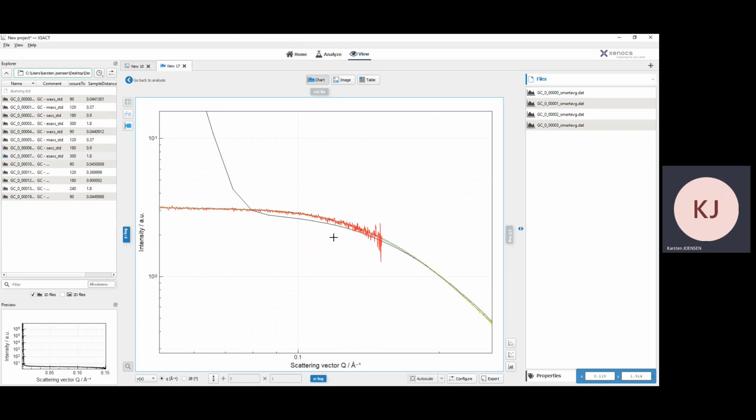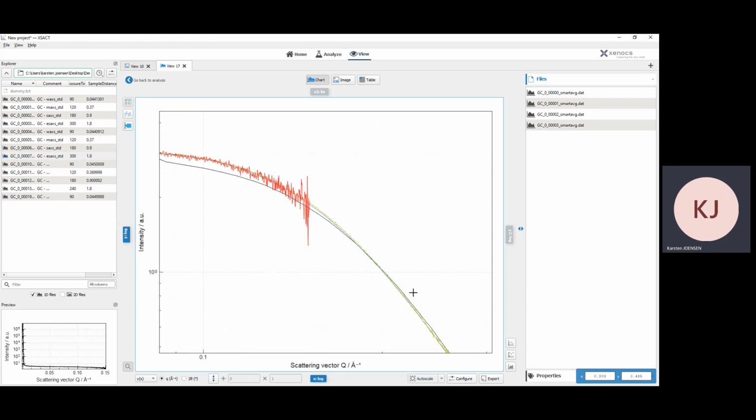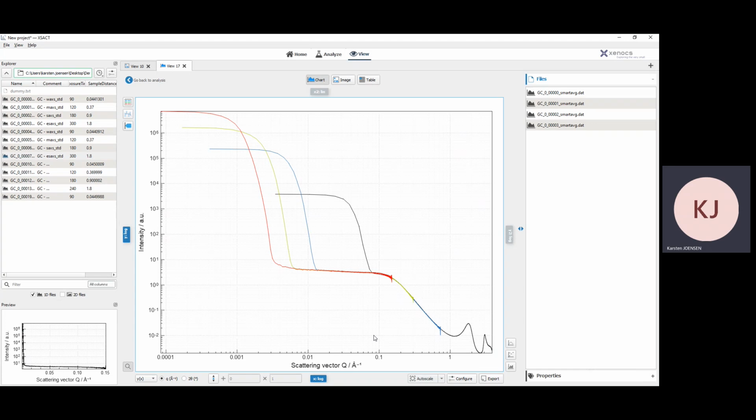So what we have going on here is that we have a number of measurements with different resolution functions in that same area. And what is most likely happening is that as we get to that curve, those different resolution functions are resulting in a slight reduction of the lowest resolution function at the high point, as that's being sort of thrown out into the tails of this. So we can take a look, and indeed there is a crossing here where this becomes higher out here. So that looks like that's a resolution function issue.